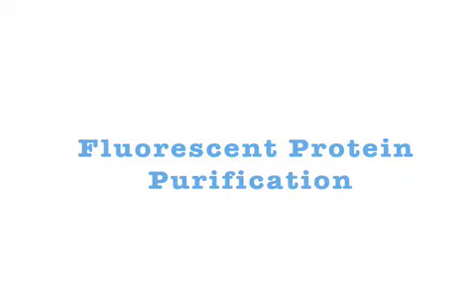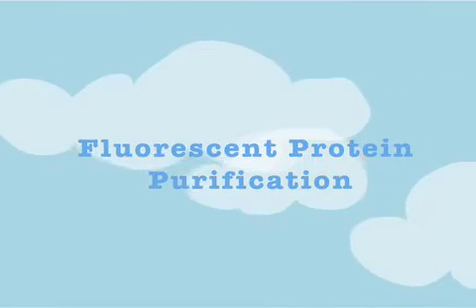This is a video from ScienceBridge and High Tech High. Fluorescent protein purification.